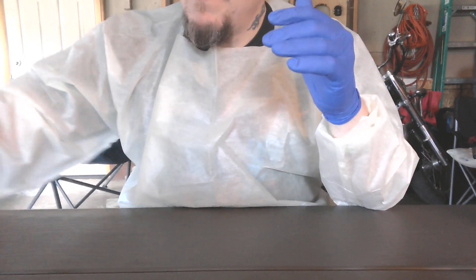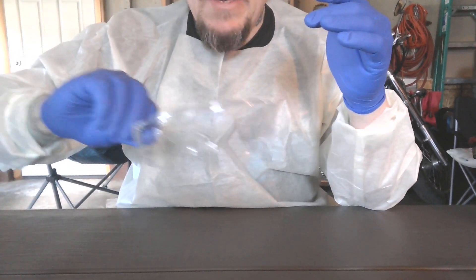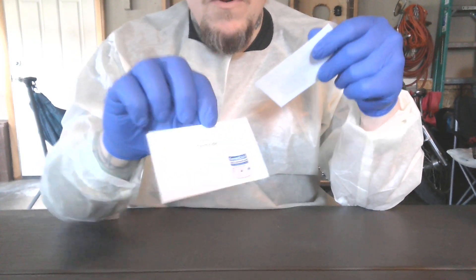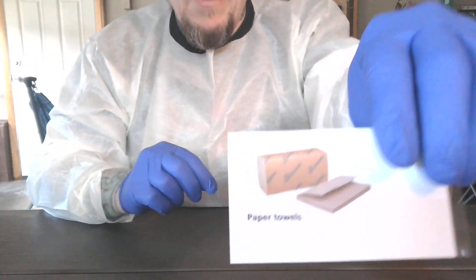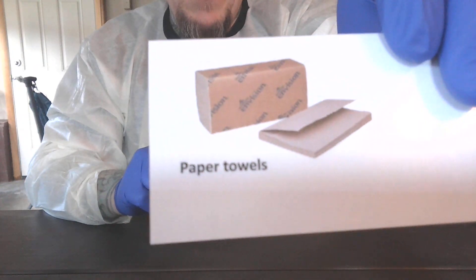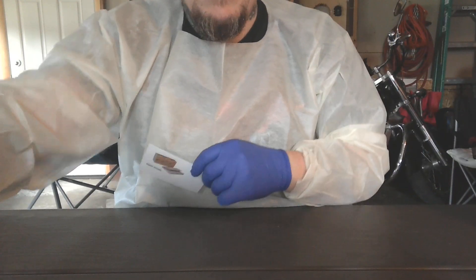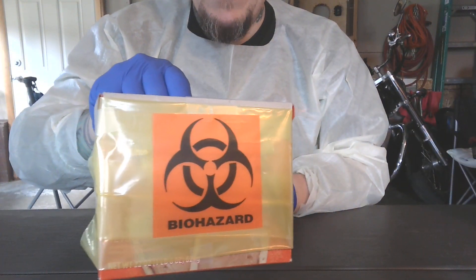Cover, gloves, safety glasses, clean your area, germicide. Let that work and then wipe it down with some paper towels. You're going to toss those into the biohazard waste window.